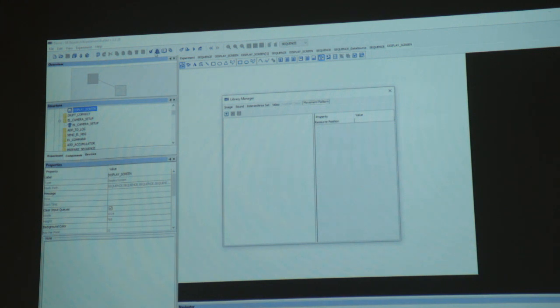Okay. So if you don't see anything here but you see it in the folder, it could possibly indicate that your file in the folder is corrupt, which is why it's not showing. So anything that can be loaded and can be used in the design will show up here. Whether you want to use it or not does not matter. If you don't want to use it, let it be in the folder. It does not affect your experiment.